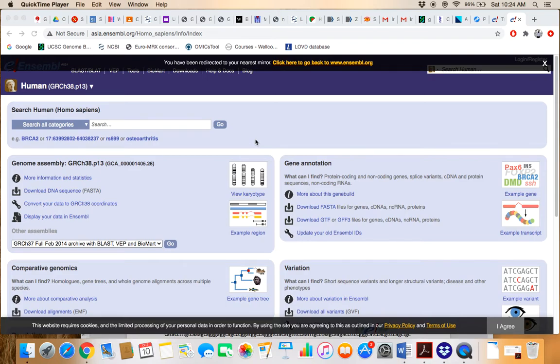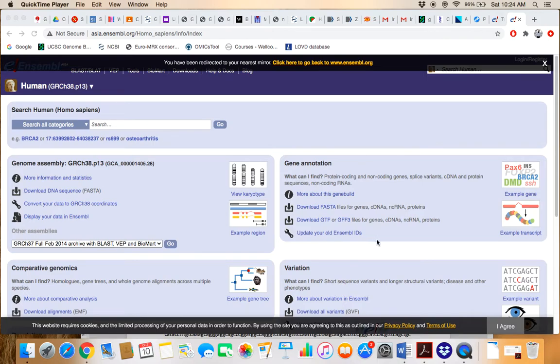Bismillahirrahmanirrahim. The topic of our discussion is how to retrieve the protein and mRNA sequence using the Ensembl Genome Browser. On the Ensembl Genome Browser homepage, we have already selected the human species.